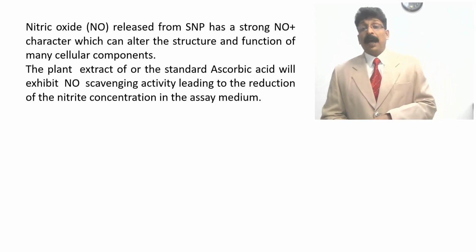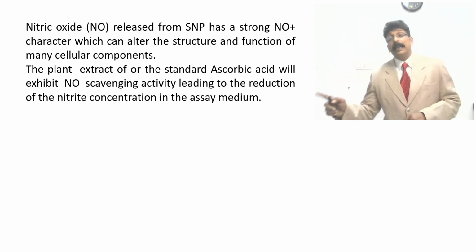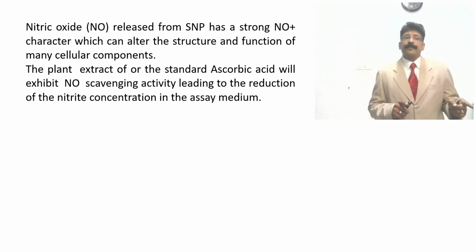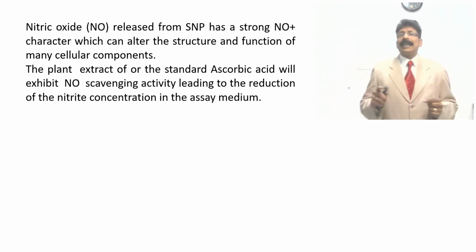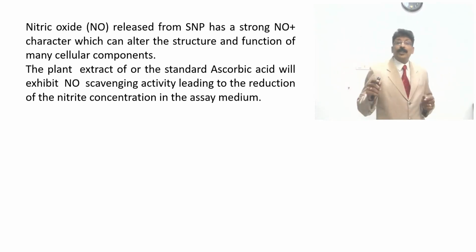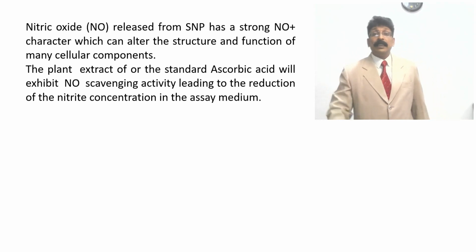So a plant extract or a standard antioxidant which you are using, ascorbic acid, will exhibit NO scavenging activity, inhibiting activity, reducing activity, leading to the reduction of nitrite concentration in the assay medium.